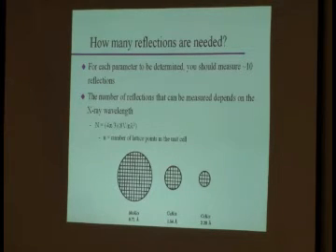Here's one of them. How many reflections do you actually need? And that's a good question because we haven't talked about that at all, right? Well, we certainly have learned in math that if we have a set of simultaneous linear equations, we need about one observable per parameter, right? Everybody has heard that before. However, we don't have linear equations in crystallography, do we? We have e functions, stuff like that, complex e functions. So we need more than one observation per parameter.